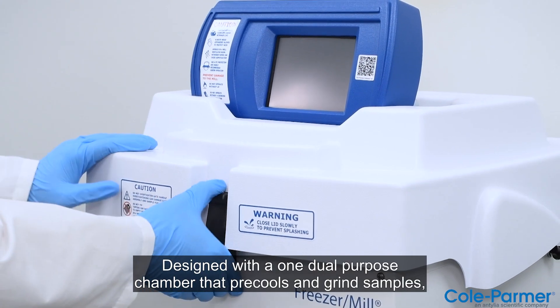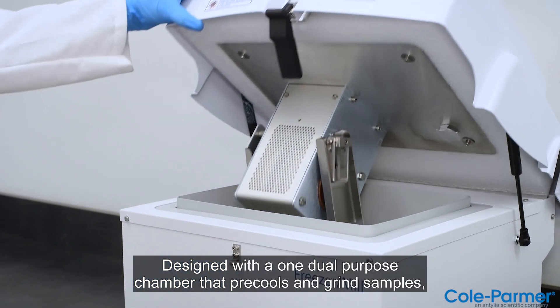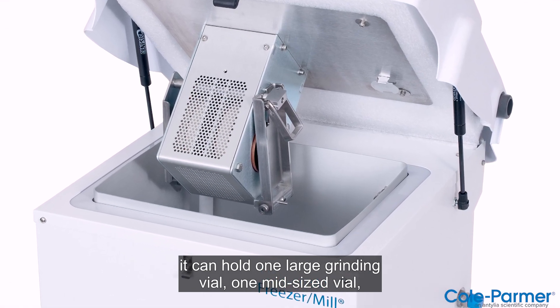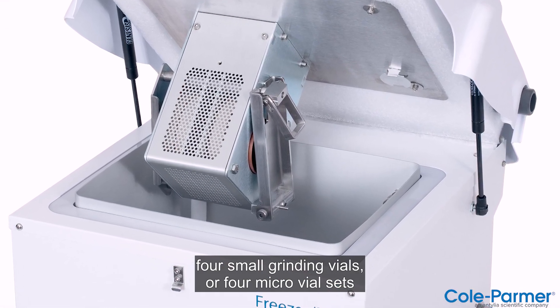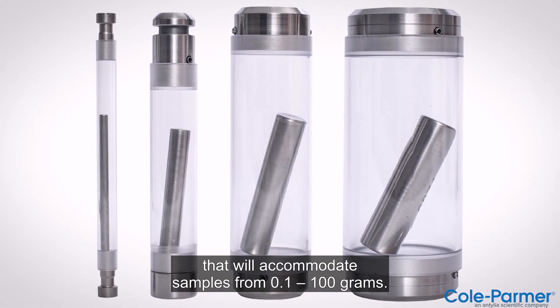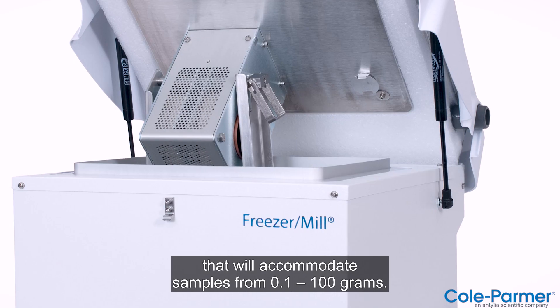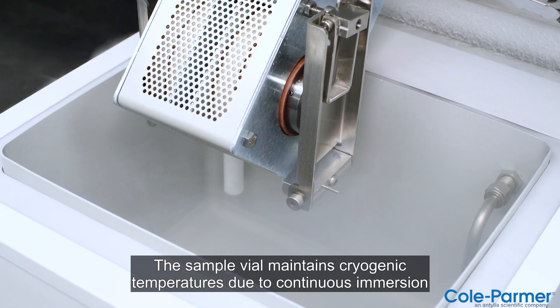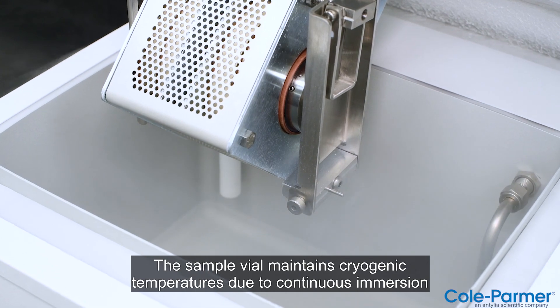Designed with one dual-purpose chamber that pre-cools and grinds samples, it can hold one large grinding vial, one mid-sized vial, four small grinding vials, or four micro vial sets that will accommodate samples from 0.1 to 100 grams. The sample vial maintains cryogenic temperatures due to continuous immersion in liquid nitrogen.